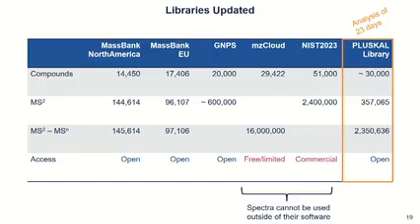But for the last ones, we have the problem: they are very big and very often manually created and of high quality, but the data can't be downloaded and used for any method development for machine learning, so we are limited. We can use spectral library matching if you have the software, but if not, you can't use it for anything, so it can't be used in the future. Because we can only annotate things that are in the spectral libraries, we are still very limited in what we can annotate based on this.